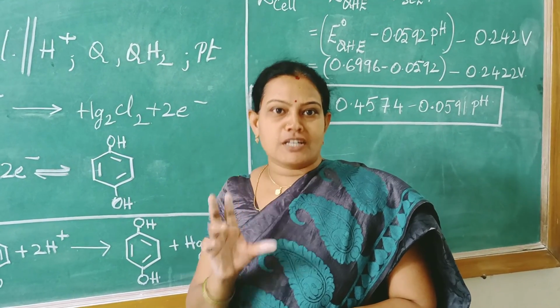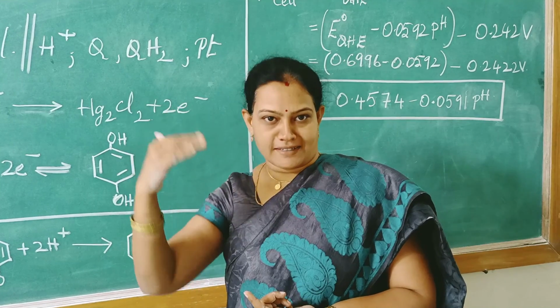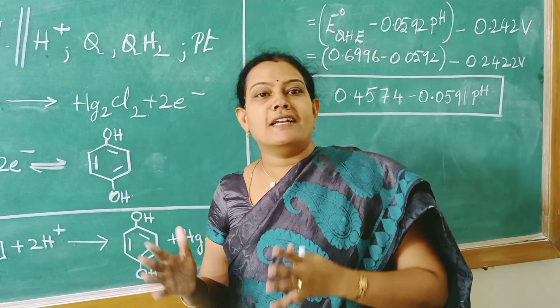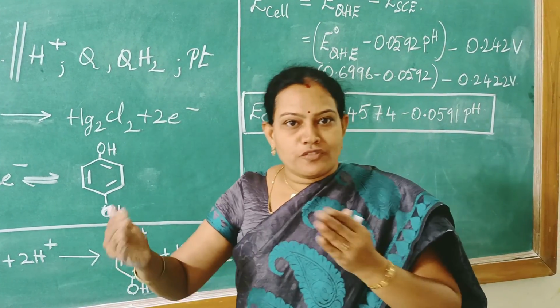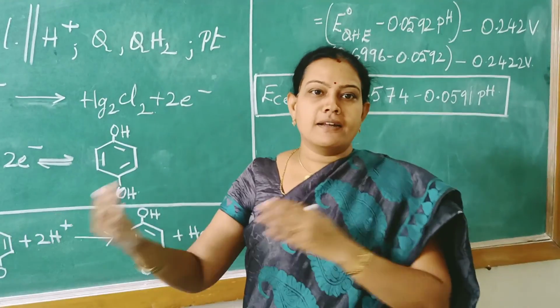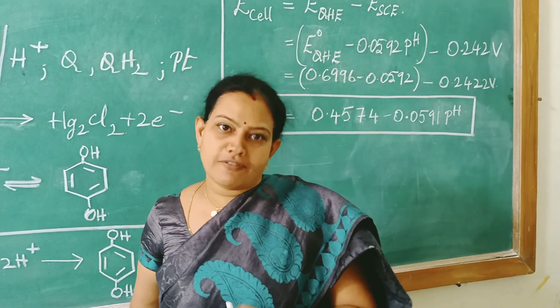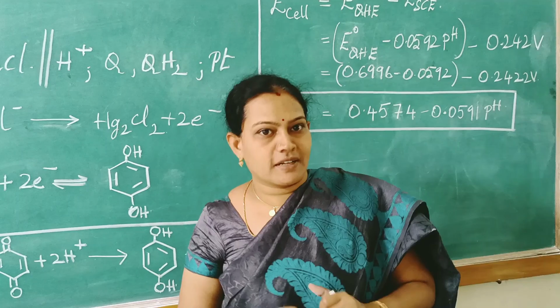When you measure the potential difference values during the acid-base titration, the changes occurring in the potential difference indicate the completion of the titration, from which we derive the reaction completion, the concentration calculation, and the amount of HCl finally. So this is how we approach potentiometric titrations.